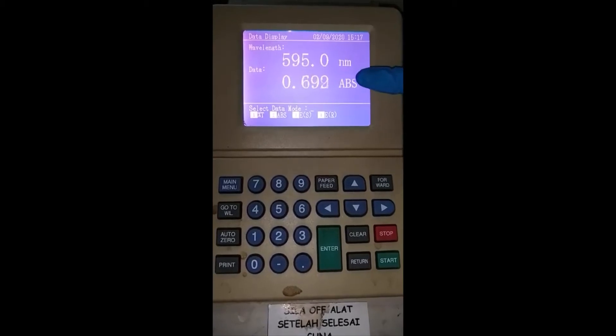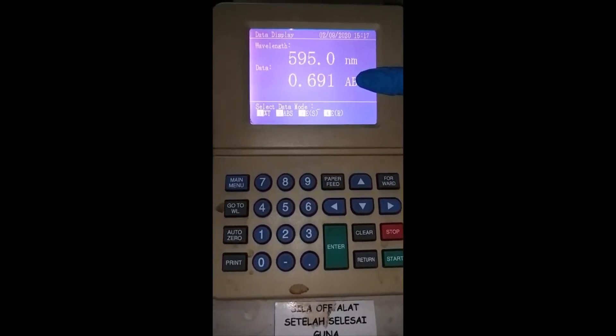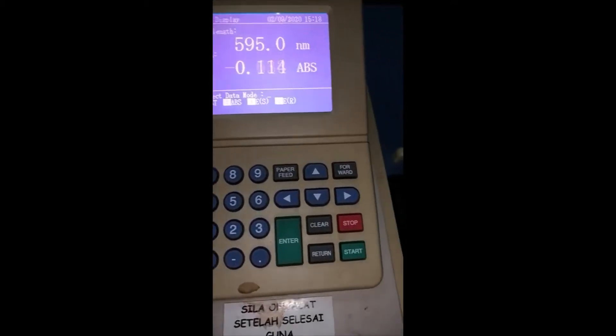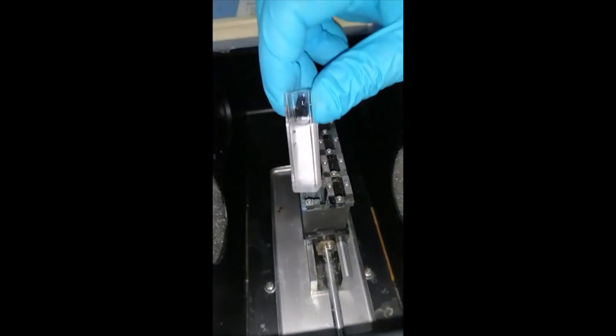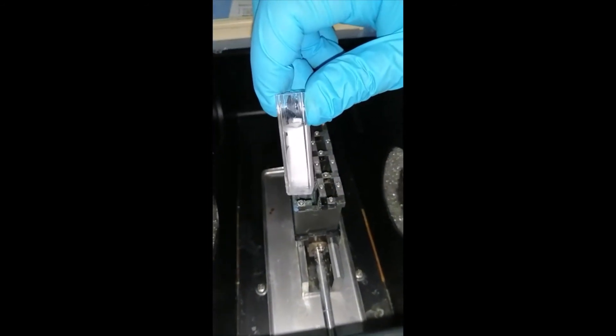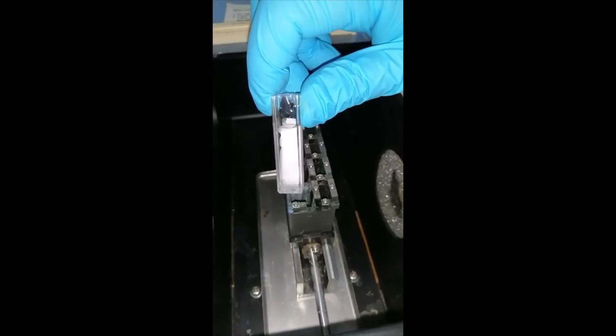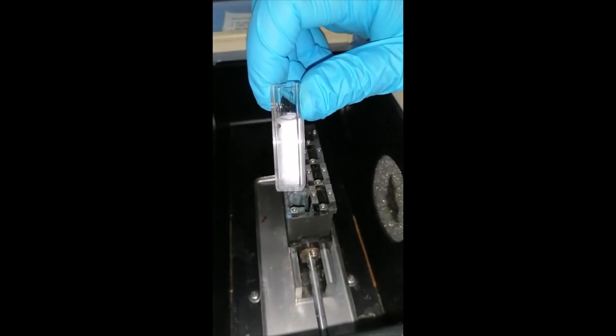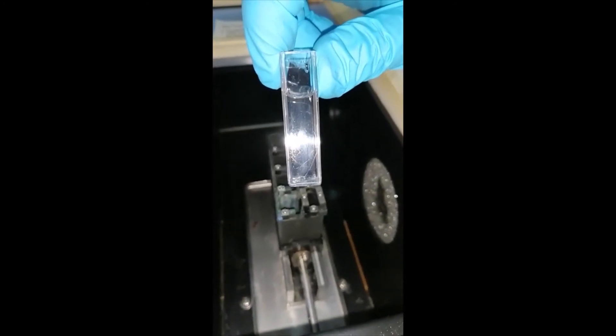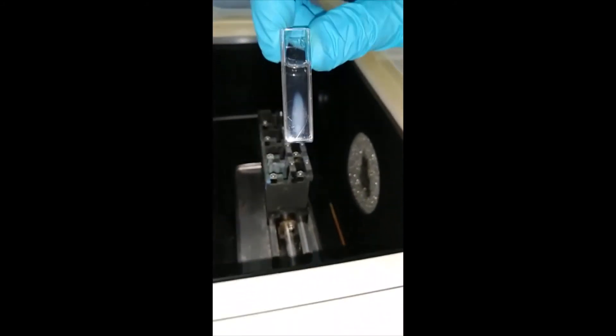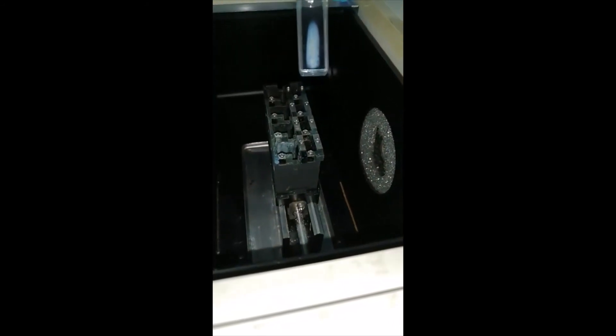Jika bacaan tidak stabil, lihat semula kuvet anda. Pastikan permukaan kuvet dilap dengan bersih, tiada gelembung udara, sample tidak berada dalam keadaan sejuk. Pelantar kuvet berada dalam keadaan yang betul.